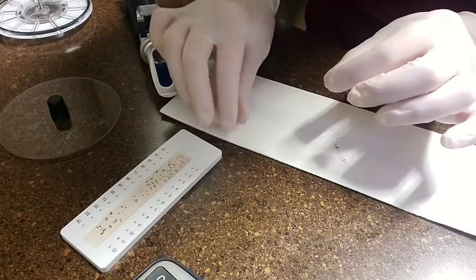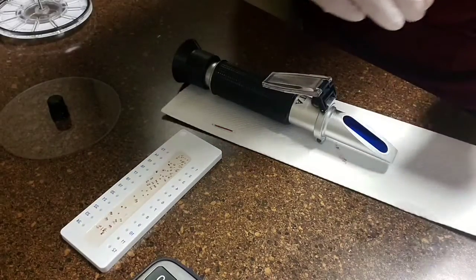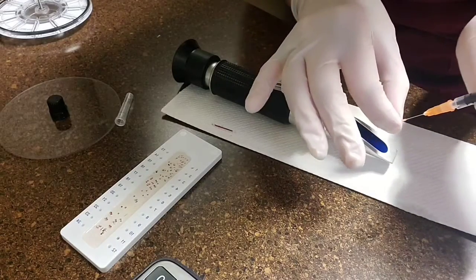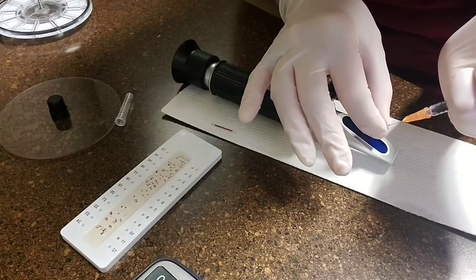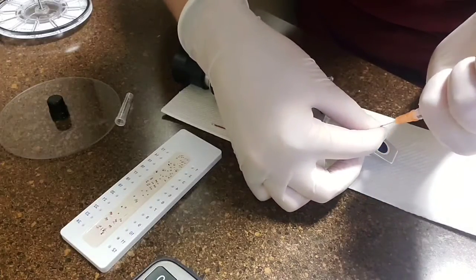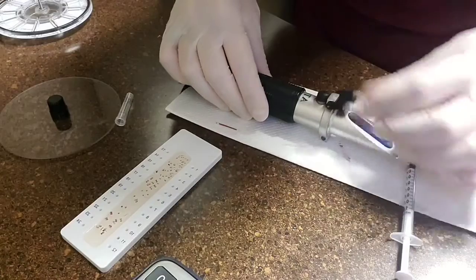As you can see, this is where my syringe comes in handy. I just take this and insert it into the top part of that tube where there isn't any plasma, and push some of that air out, or air through it, to give me enough sample to actually read.